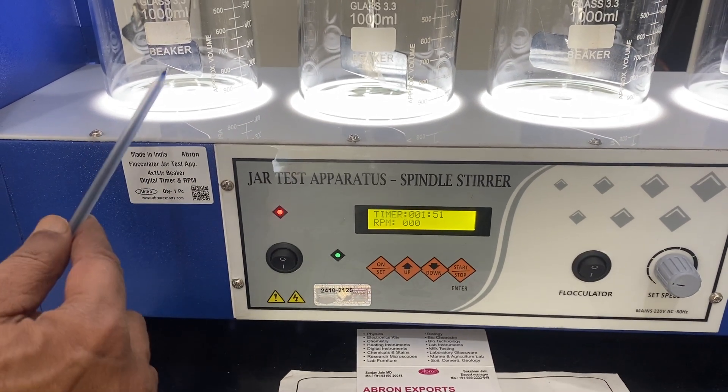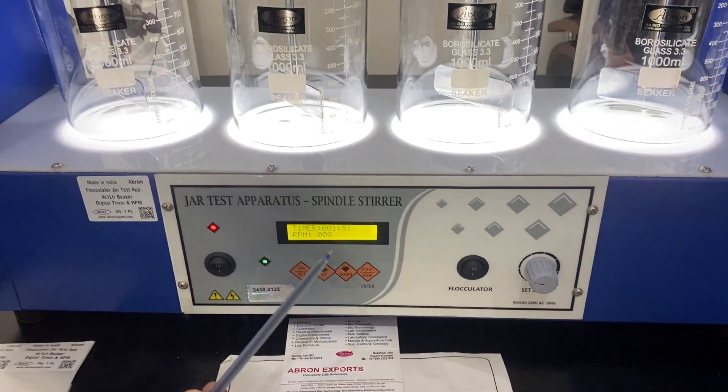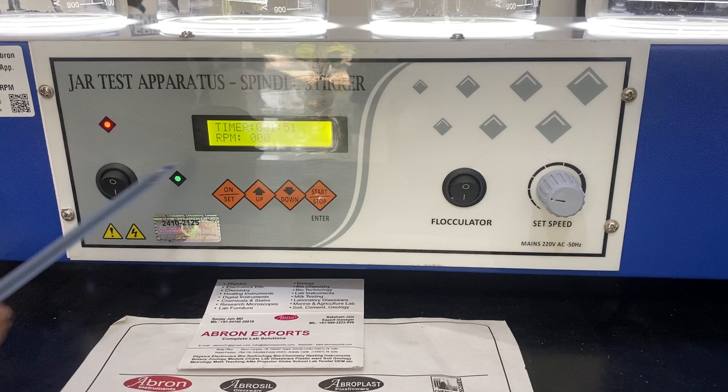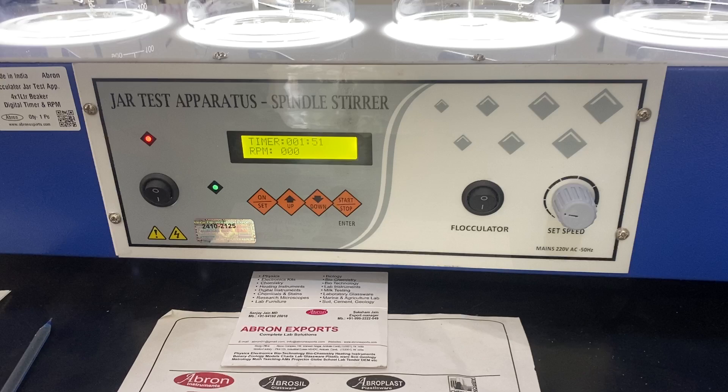This one is modular with 4 beakers of 1 litre each. There is a timer and the stirring speed can be adjusted with this control, and the timer can be adjusted from here.